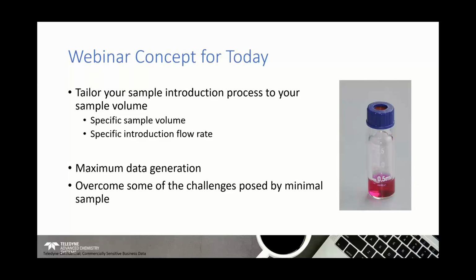What I want to refer back to through this webinar is the idea, with respect to ICPMS sample introduction, of how we can tailor the sample introduction process with the MVX system to the sample volume that you have. That sample volume will vary across every laboratory's different requirements, whichever kind of application you're working with, the kind of analytes people are interested in, etc.